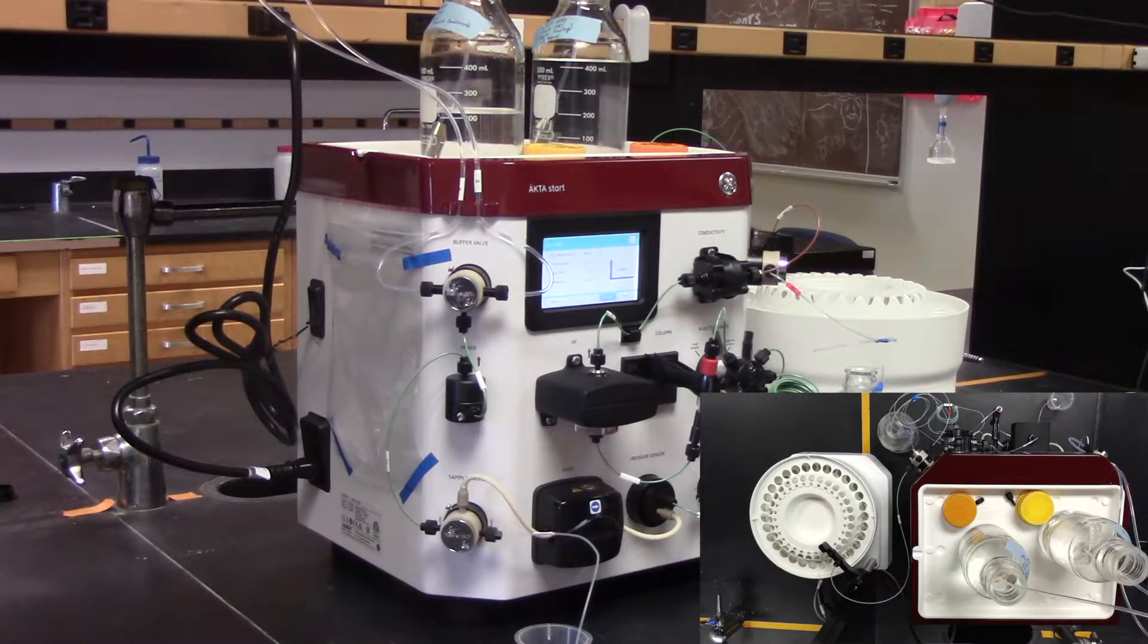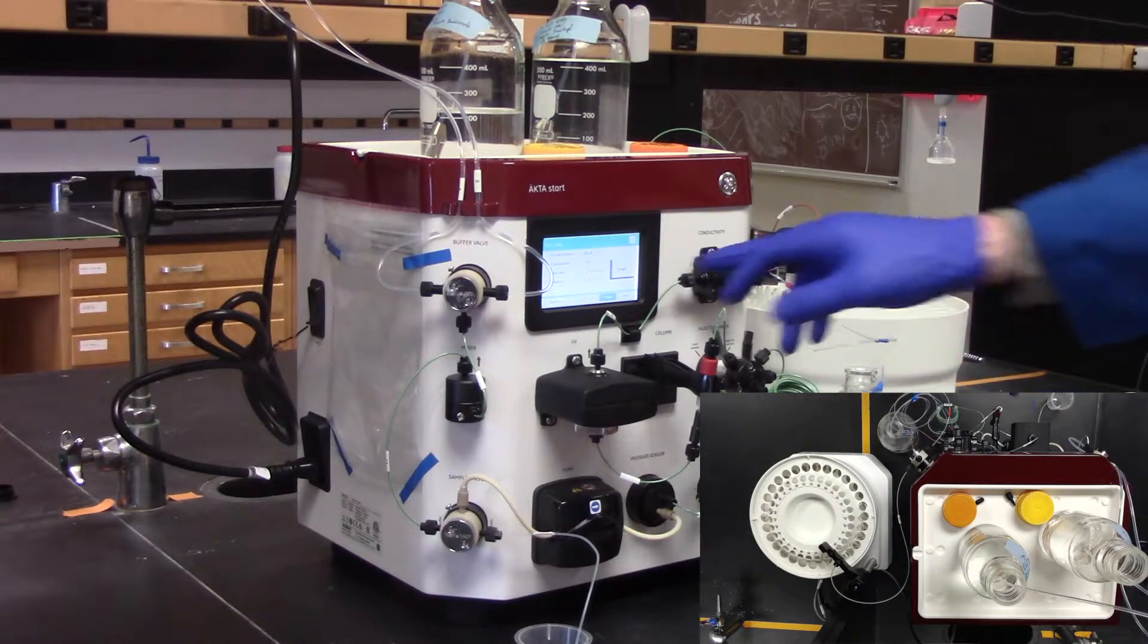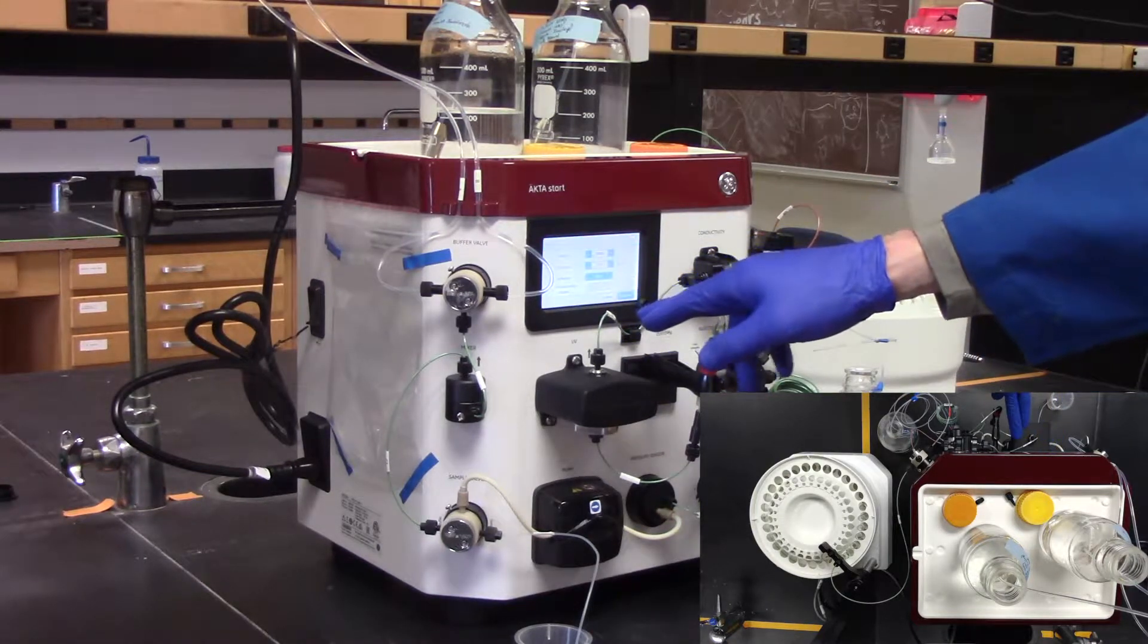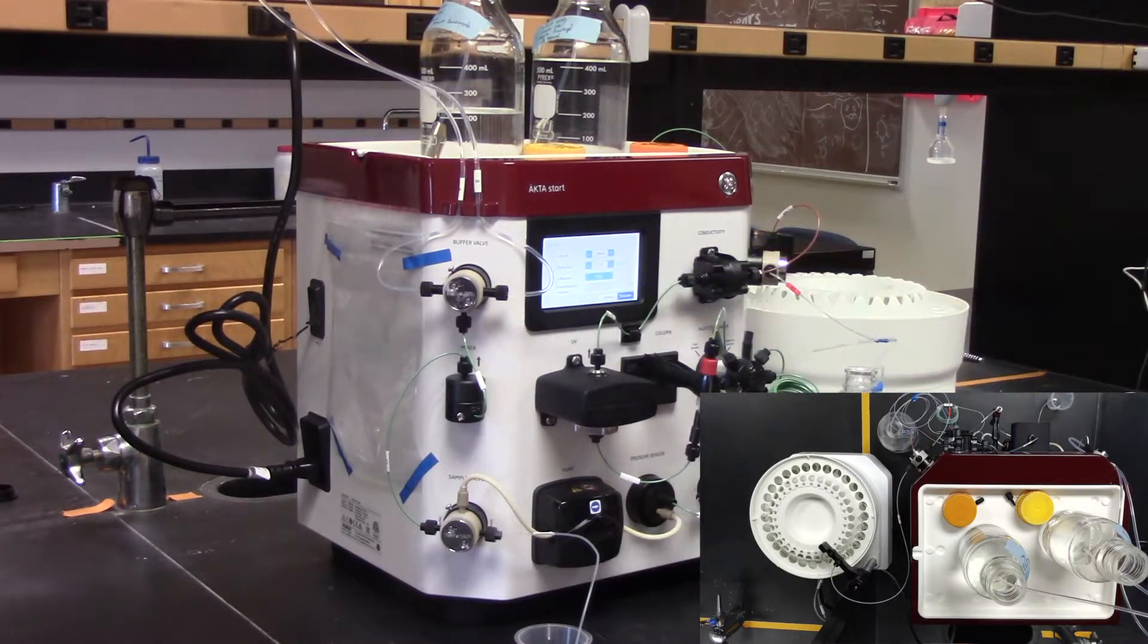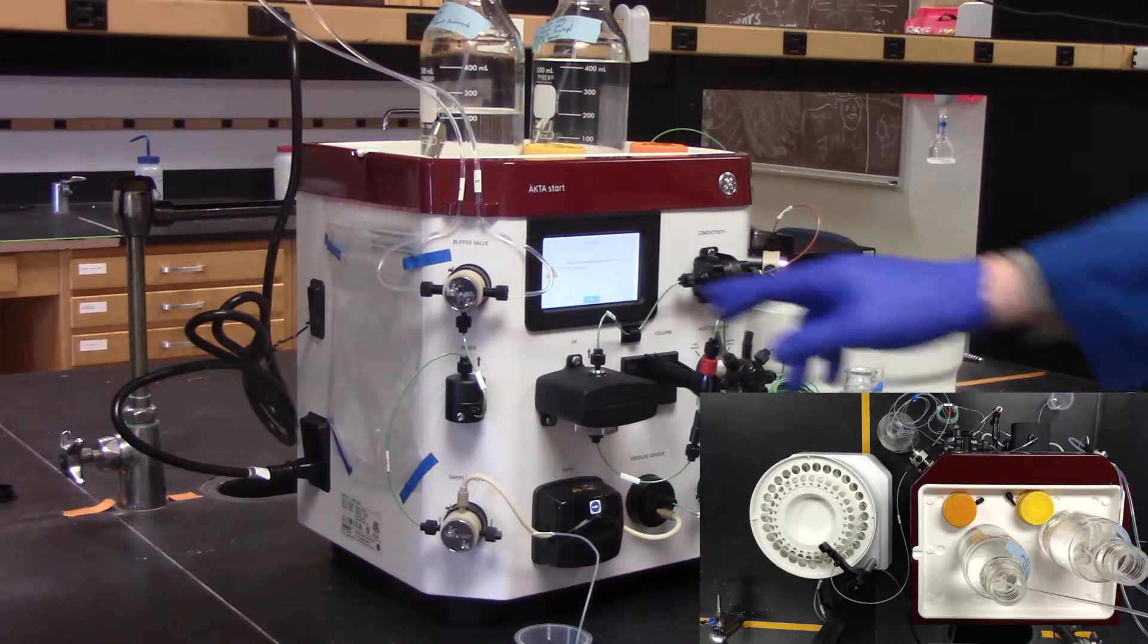To elute your protein from the column, switch your concentration of buffer B to 100%. As you see an increase in absorbance, begin fractionation. Collect anywhere between 3 to 5 mL fractions.